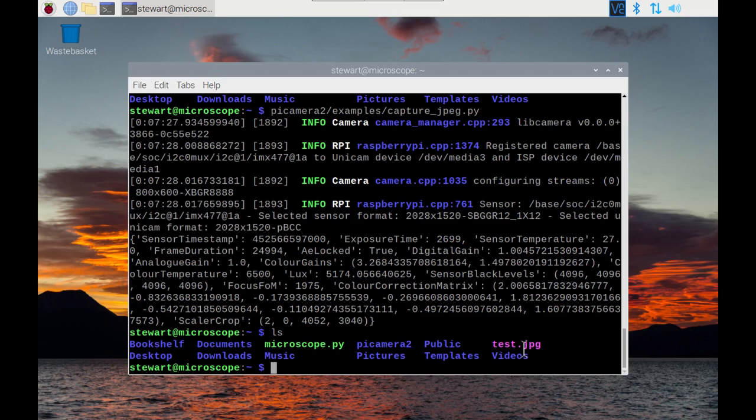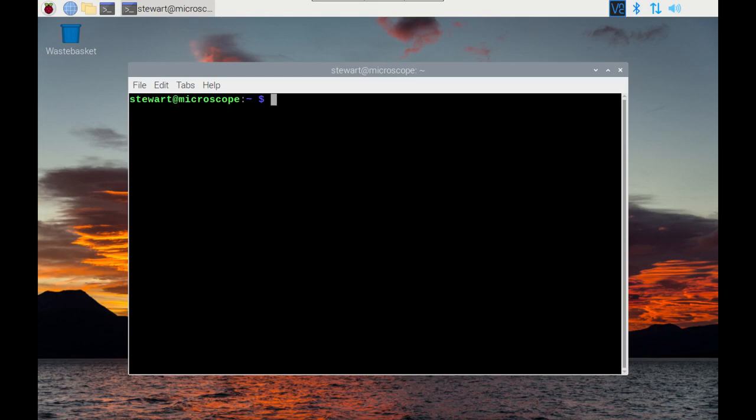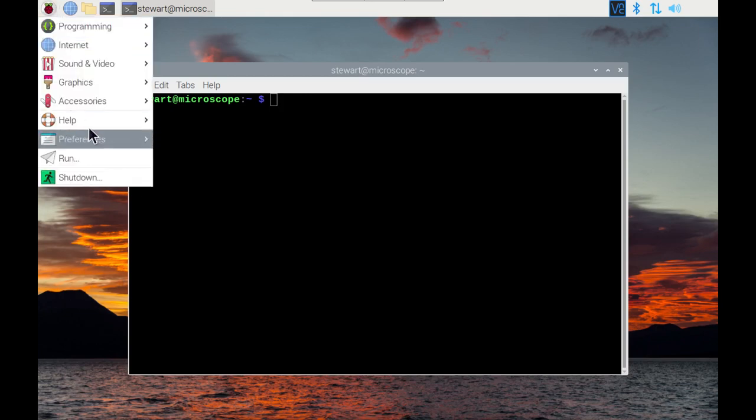One thing I like to do particularly using my microscope is to capture multiple images, one after the other. So I've created my own Python program based on these example codes to allow me to do that, and I'll show that next.